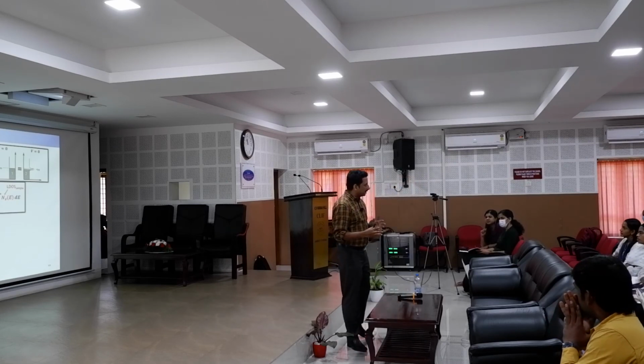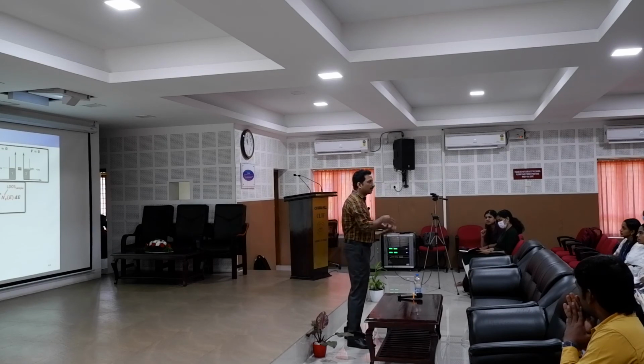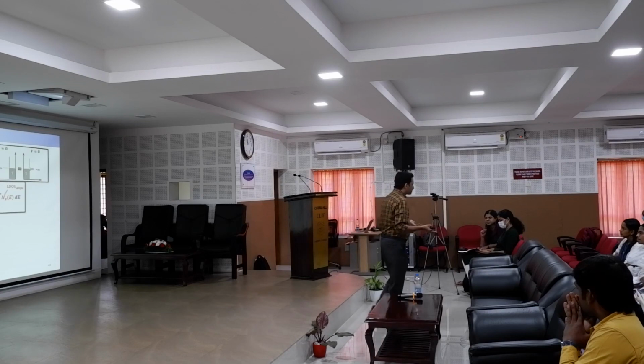So like that we can measure the valence band density of states and conduction band density of states, and the density of states is very important for applications. Because how many electrons you are getting outside, how many electrons can flow through the material, all depends upon how many states there are in the valence and the conduction band, or HOMO-LUMO levels. Without which it will be a useless material.